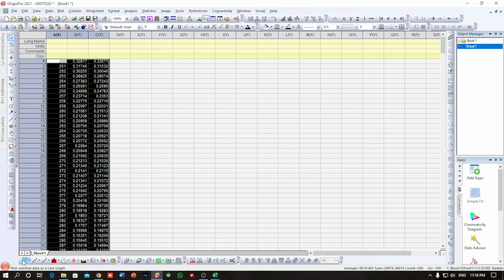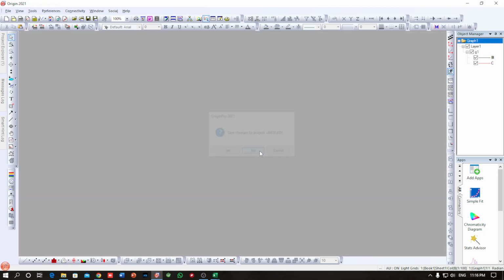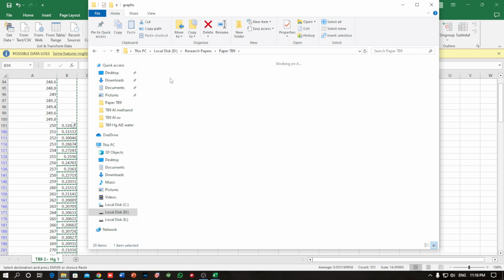Now press on the line button, so you can see that this is my line. Okay, so hence the peak will be generated and the graph will be generated. So I can show you the demo. I did not save it. I had already saved it in a new folder. So this is my generated file.